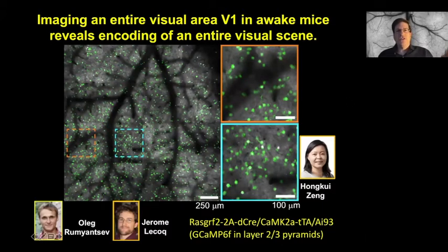And so here you can see some example images from this animal, in which the fluorescently labeled cells are colored green atop the black and white image that we got with this 16 channel 2-photon microscope.